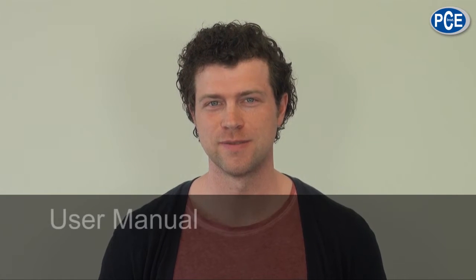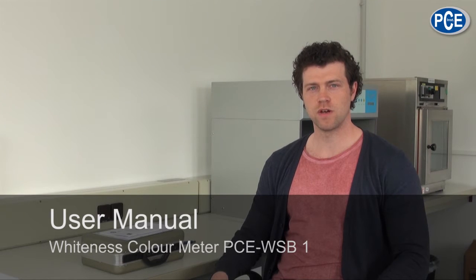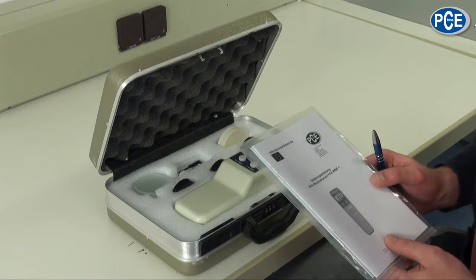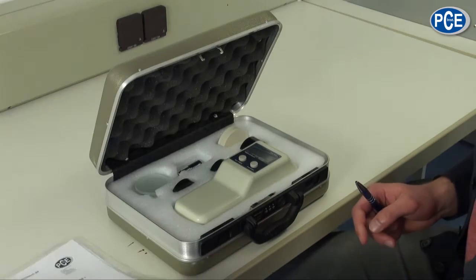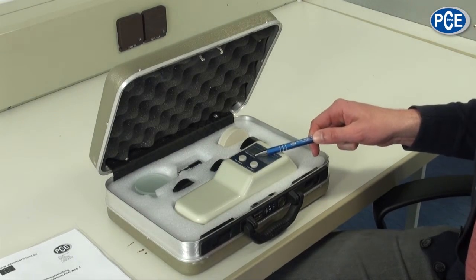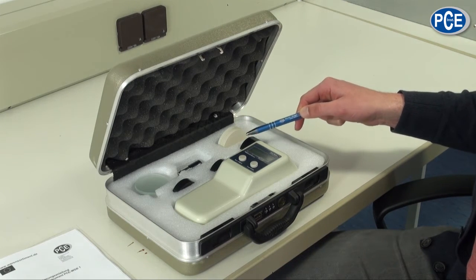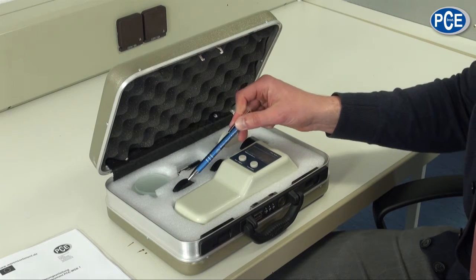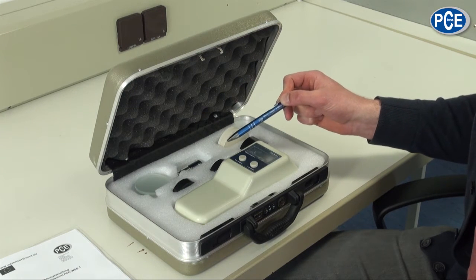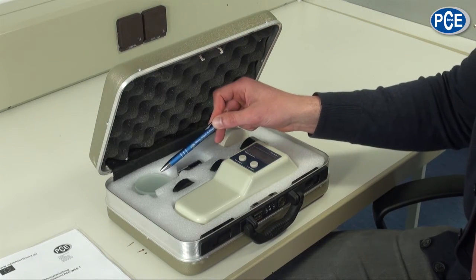In this video I would like to show you how to use the PCE WSB1. The WSB1 is delivered in a robust case. In the delivery you can find the following items: an instruction manual, the measuring device, a white standard, a black standard, two test boxes for different materials such as powder or granulates, batteries, and a glass plate.